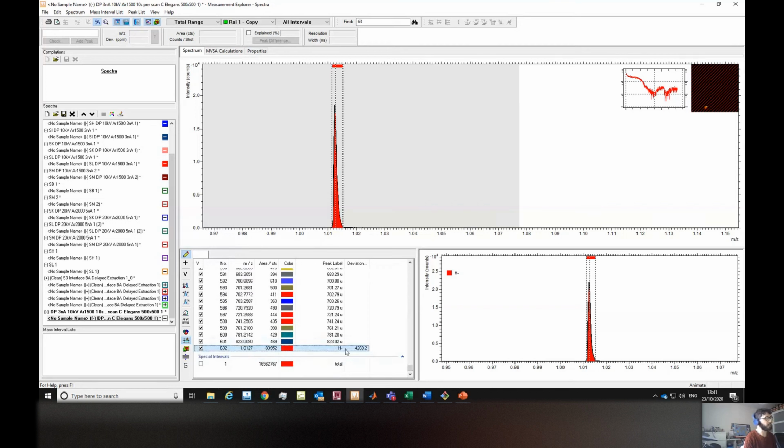And we're used to having these lists ordered by mass, right? When you export this to simsMVA or load into simsMVA, it's a bit confusing because of the way I coded it. It will not reorder. So I need to update this, but right now a handy tool we have here in the Surface Lab is you can order by area, you can click there, or you can order by mass, which is the one we're used to.